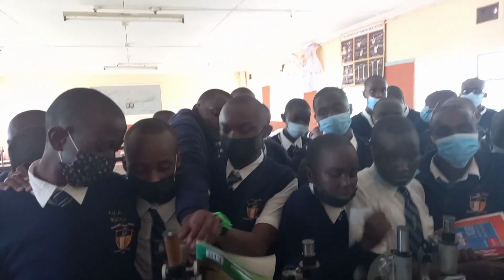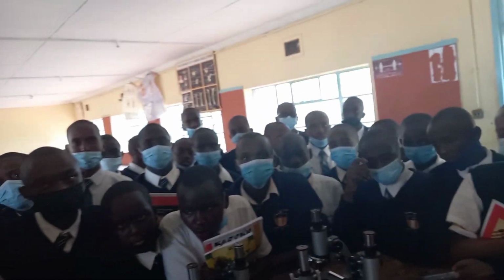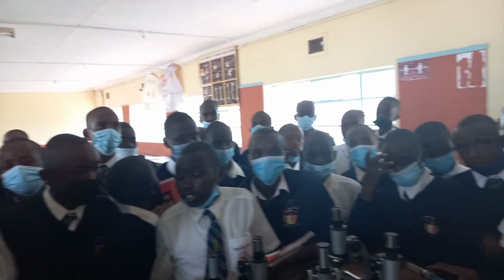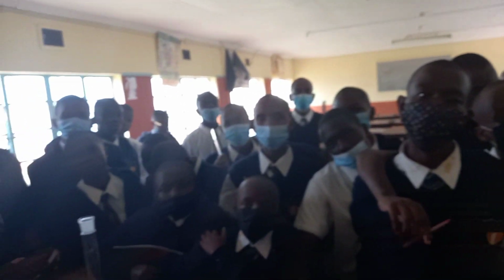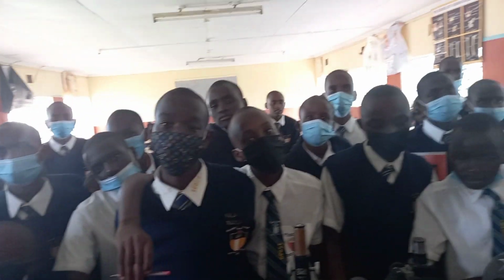All right, so we've come to the end of the lesson. Have you learned anything new? You've learned the basics of using a microscope. In the next lesson, we are not going to use permanent slides. We are going to make our own slides and observe them. Now that you know the basics, it's going to be easy for you.